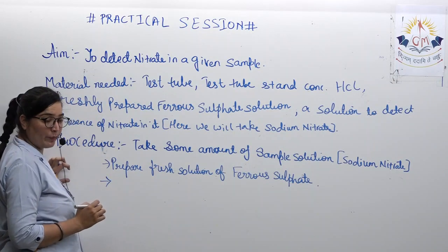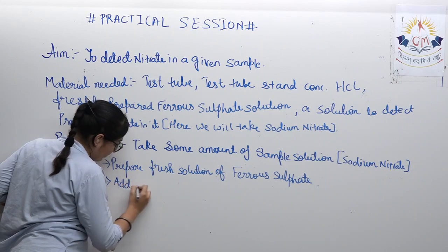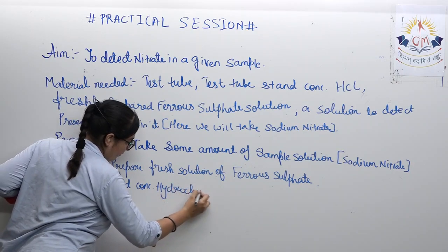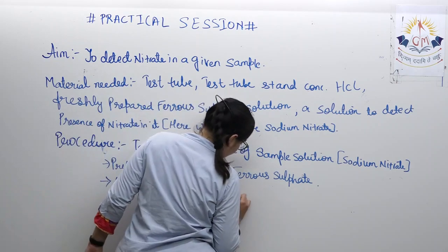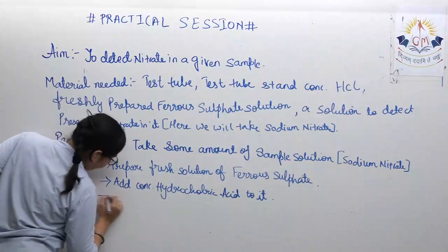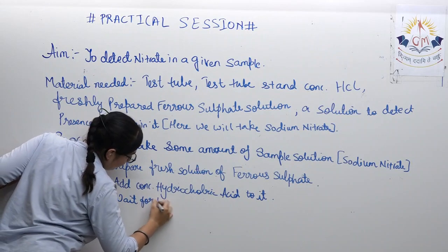We need to add hydrochloric acid. And then wait for few seconds.